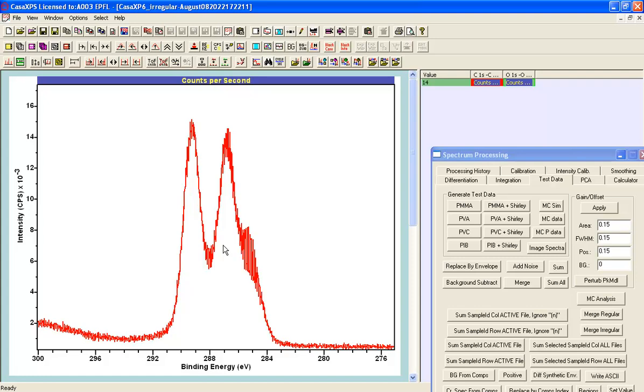So rather than having a peak model that will fit individual spectra, this will now create a peak model that fits no spectra in particular, but what it does do, it will allow you to fit components with the common full width half maximum and position that is dictated by these merged spectra, that the average spectrum is the target of a least squares fit when we merge data in this form.